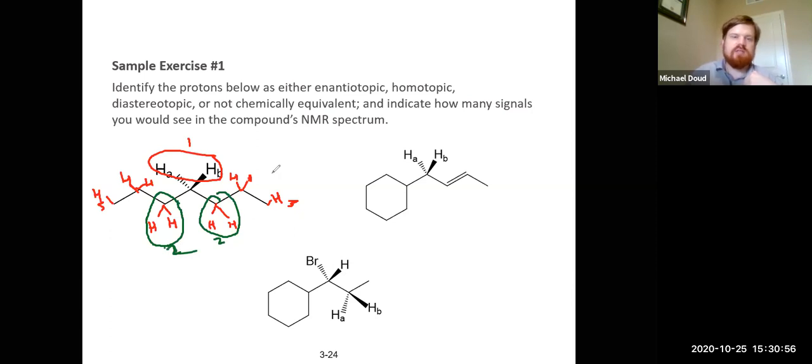Now, I hope you can see where this is going from here, because the same thing is still true as we move one further out. When we rotate this molecule, these carbons and hydrogens are going to line up on one another. So that gives us our third signal. And then finally, out here, we've got our 2 methyl groups. That's signal 4.